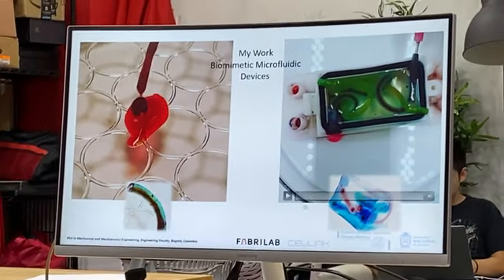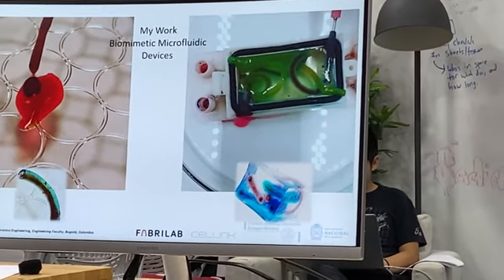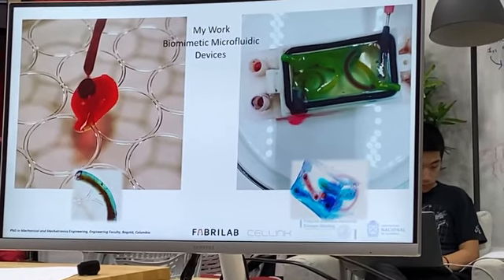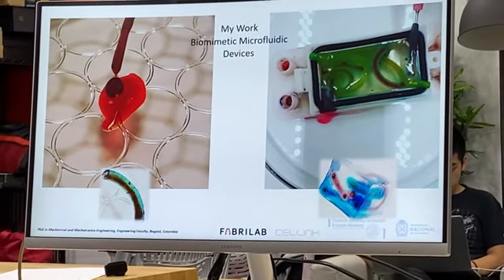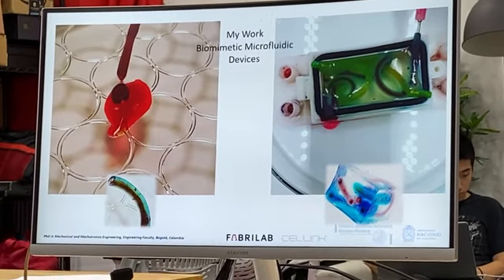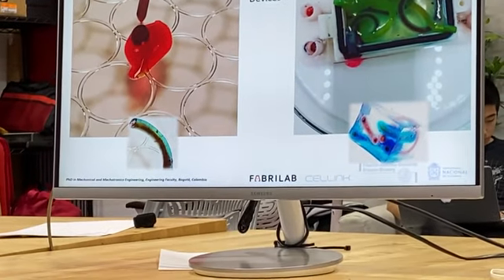And here is the microfluidics device that I developed just to show that it is possible as well to print a structure like this. I mean, normally the microfluidic structures are 2D, but with this development you can create a 3D structure to test drugs or something different.